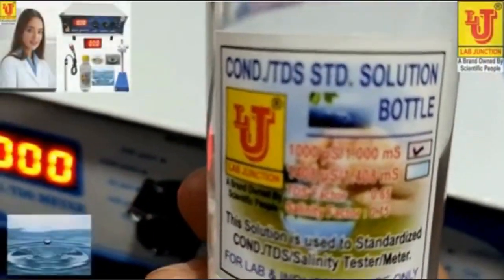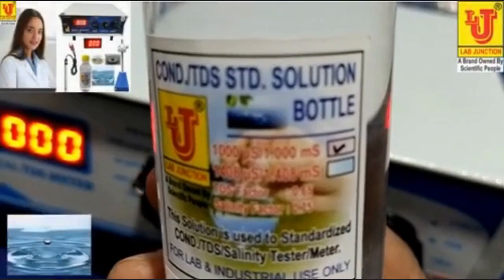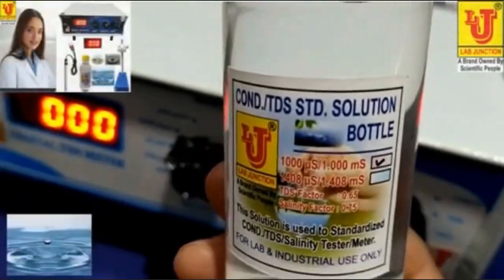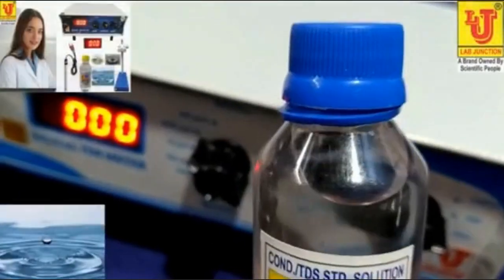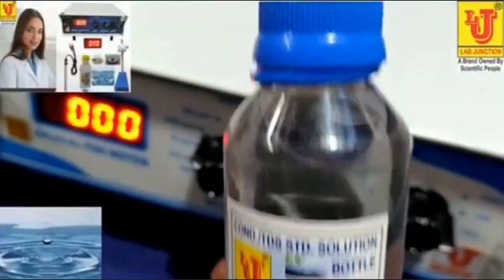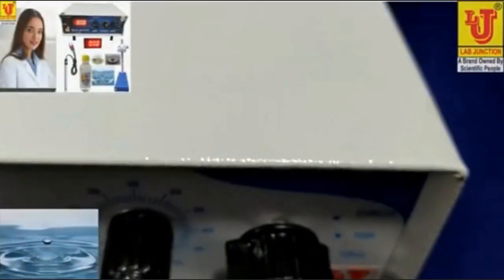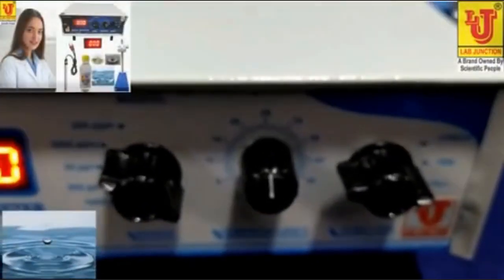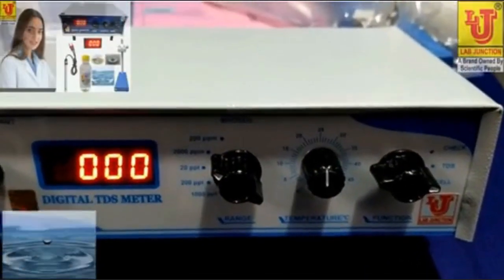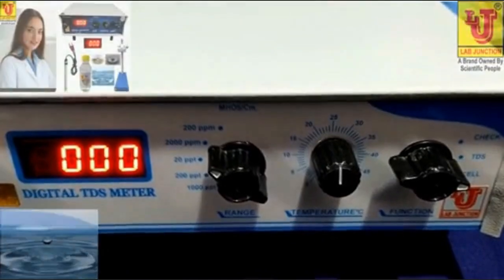This solution is to standardize conductivity, TDS and salinity meter. Now, how to standardize this digital TDS meter and how can we use it?